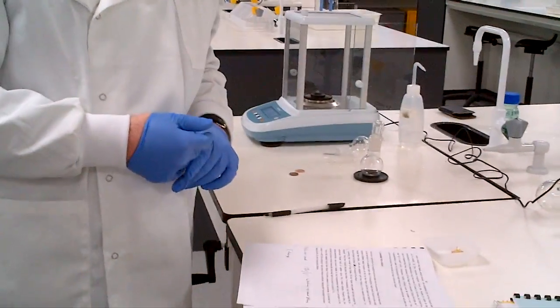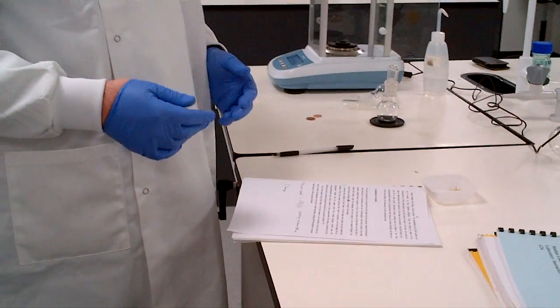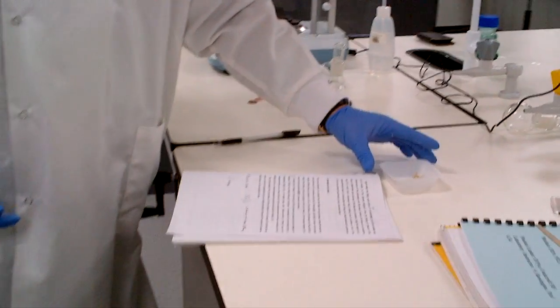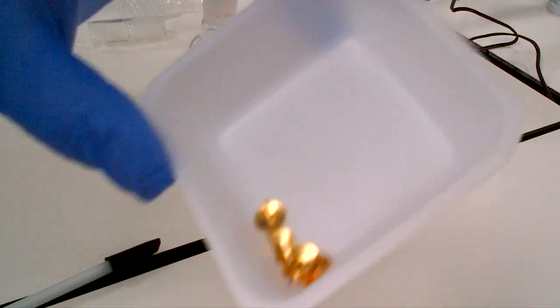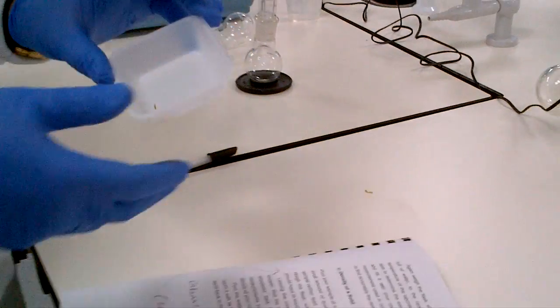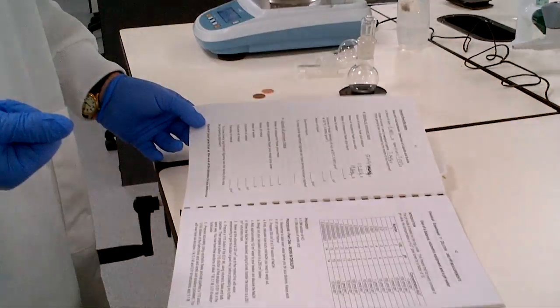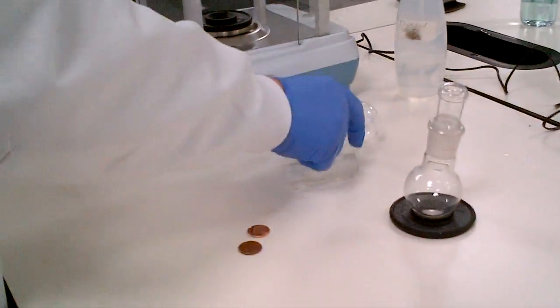So what we are going to ask you to do is, it says pour your sample from the liquid from the flask into its container, clean it, which we've done, and then add small chunks of the metal. Now this one we've got a metal as an alloy, a brass pin. So we've got a brass pin to the flask. So I'm going to ask you to take 5 brass pins and to weigh them out, okay? So it says here mass of the stoppered flask plus metal.